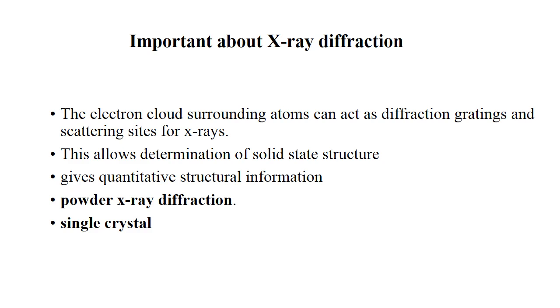Second, this allows determination of solid state structure, and the structure of solid crystalline materials. For example, lattice types and unit cell dimensions are determined by this technique. This technique is also used to determine the structure of molecules.